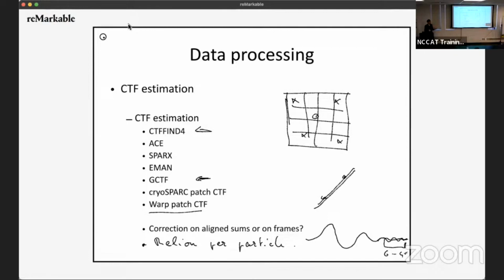That's my understanding. Now, it's possible that even with 6 angstroms, you'd get oscillations that constrain the estimation enough that you'd still be able to improve things. But yes, the limitation should be the reconstruction resolution, not the CTF estimation that was done initially.